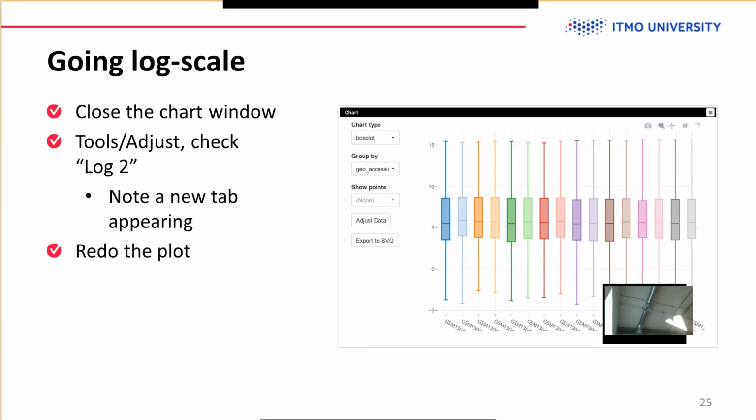Yeah. So this is one of the major things: for most types of analysis, you want your data to be log scaled. You should keep in mind whether it was log scaled before, or whether you have to do the log scale yourself. In our case, it was not log scale, it was linear scale, so we did the log scale transformation.